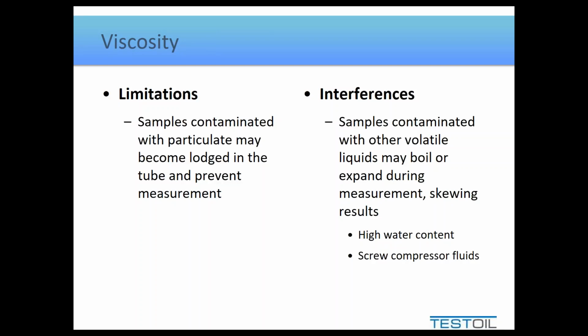So the debate that goes on is it worth degassing the sample to correctly measure the viscosity, or should we measure the viscosity as it contains all these gases because that's what it looks like within the system? There are very much divided camps on this.